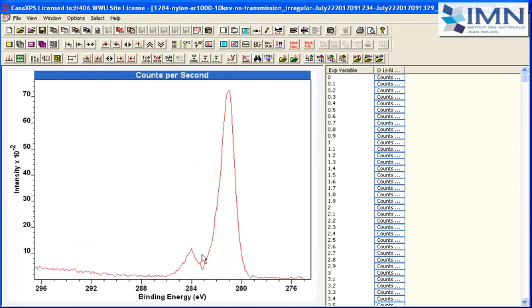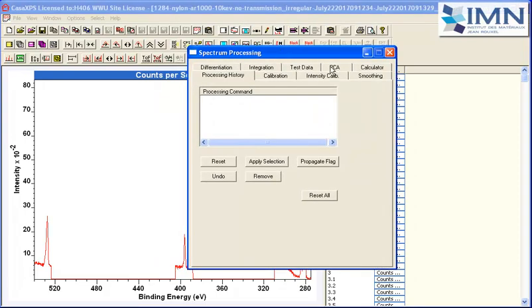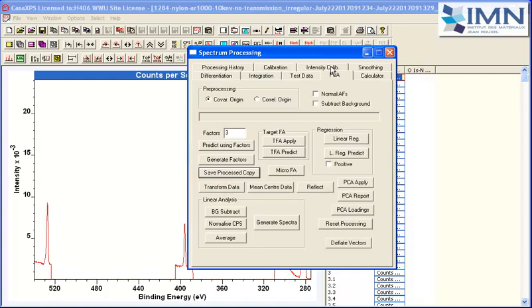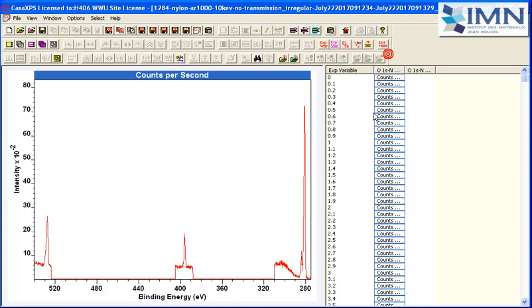So we've got a CH type peak. That looks like something that is an oxygen bonded carbon peak, and there may be a shoulder here representing the nitrogen. So overall this looks like a physically meaningful type of spectrum. So we'll take a copy of that one, and having arrived at that point in this sequence, what we'll do is return to that point here and start searching again.